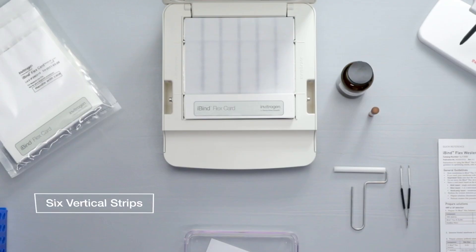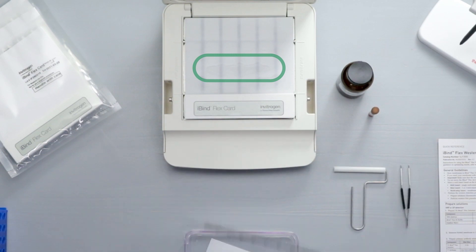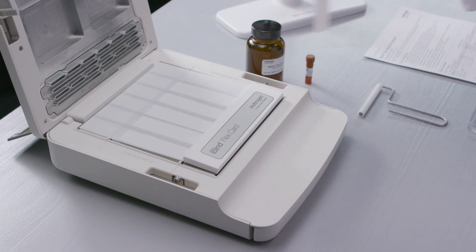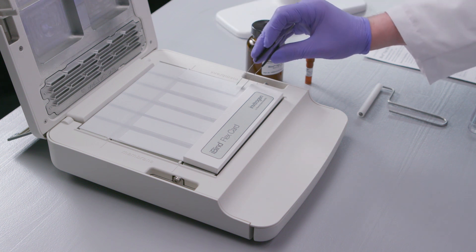For up to 6 vertically cut strip blots, start by installing the multi strip well insert. Add an additional 2 milliliters of 1X iBind Flex solution to the card, allowing it to pool. Use the alignment guides to place your blots in the white spaces between the black lines.